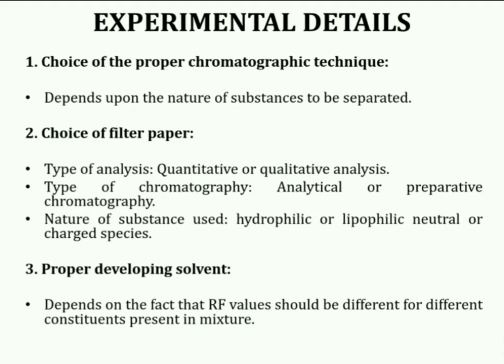Experimental details related to paper chromatography. First, choice of the proper chromatographic technique. The choice of technique depends upon the nature of substances to be separated. Next is choice of filter paper. Choice of filter paper depends on whether the paper is being used for quantitative or qualitative analysis, whether it is used for analytical or preparative chromatography, or whether the analytes used are hydrophilic or lipophilic, neutral or charged species.